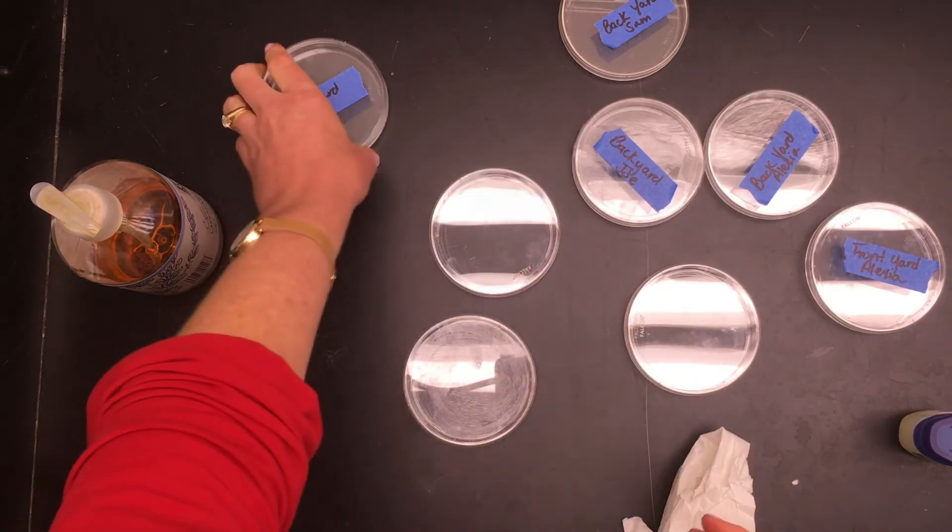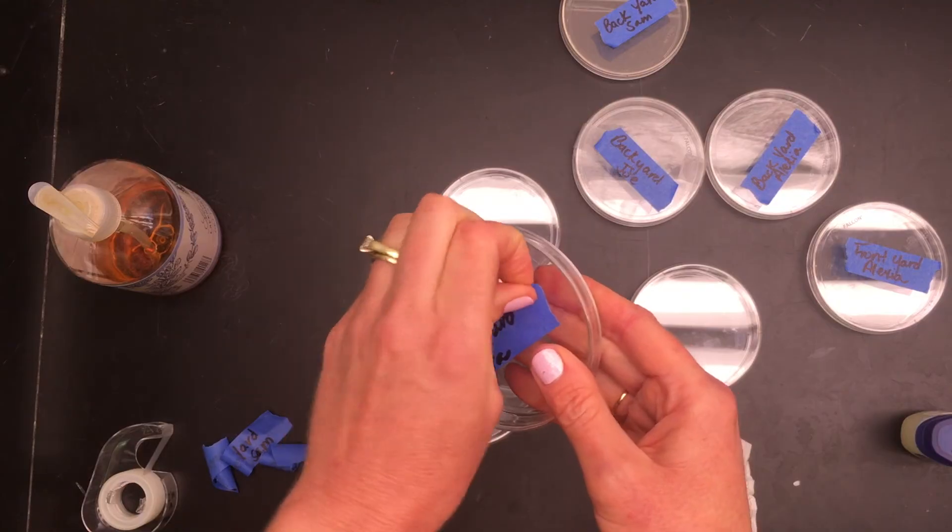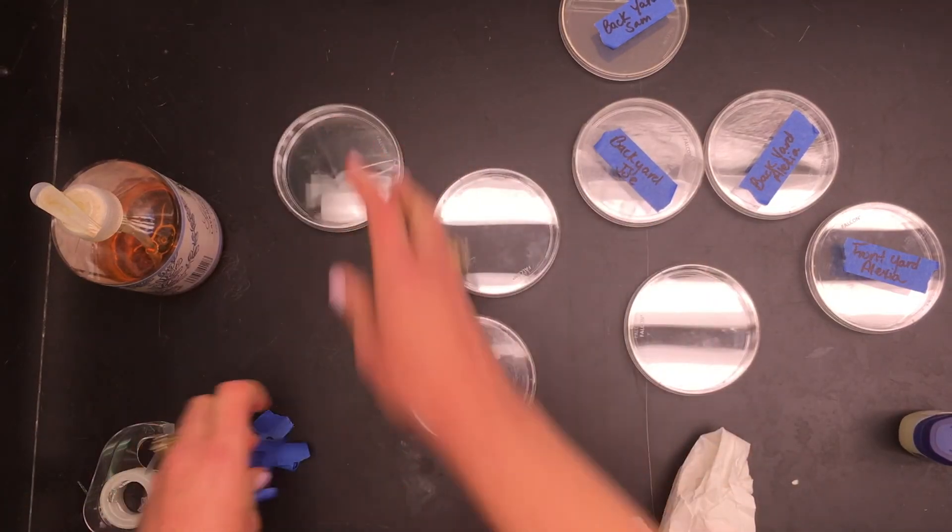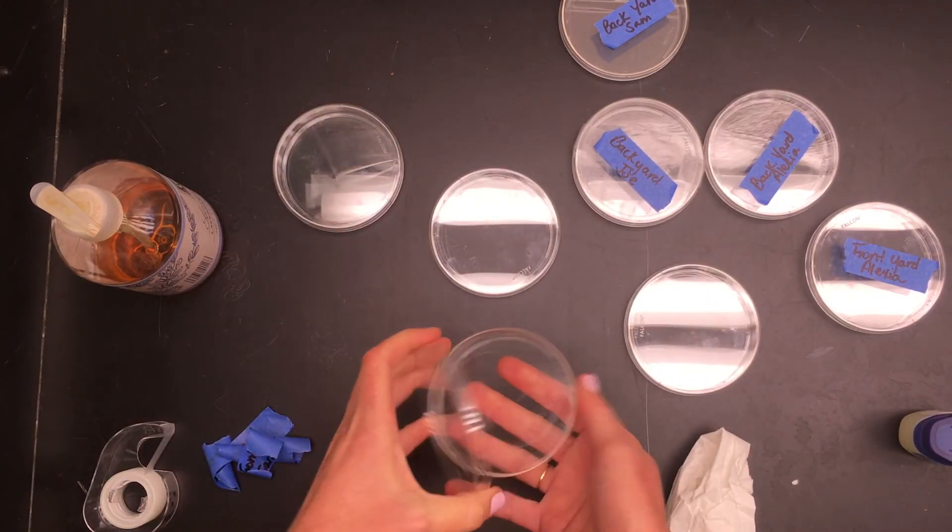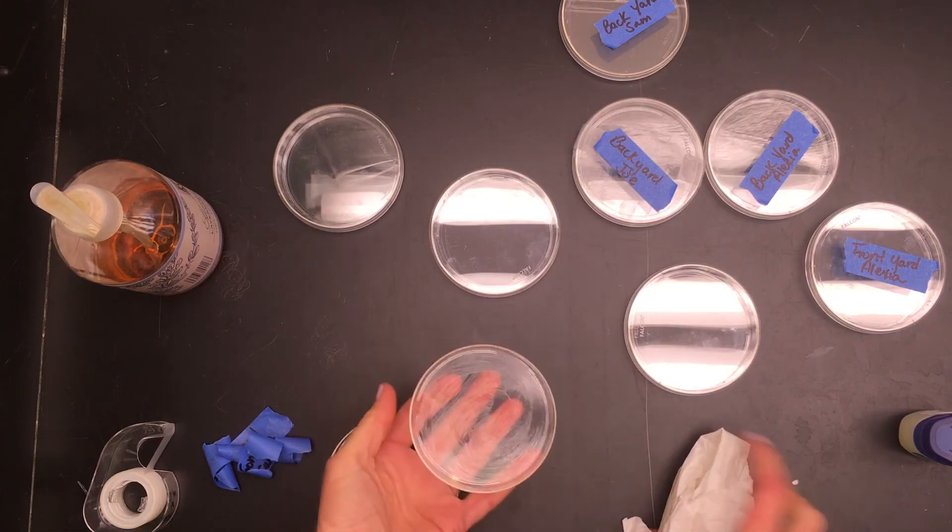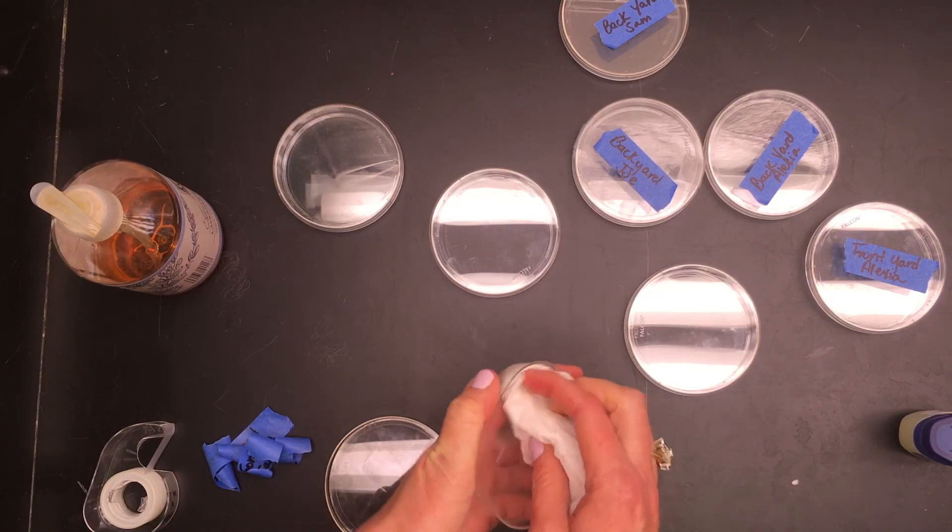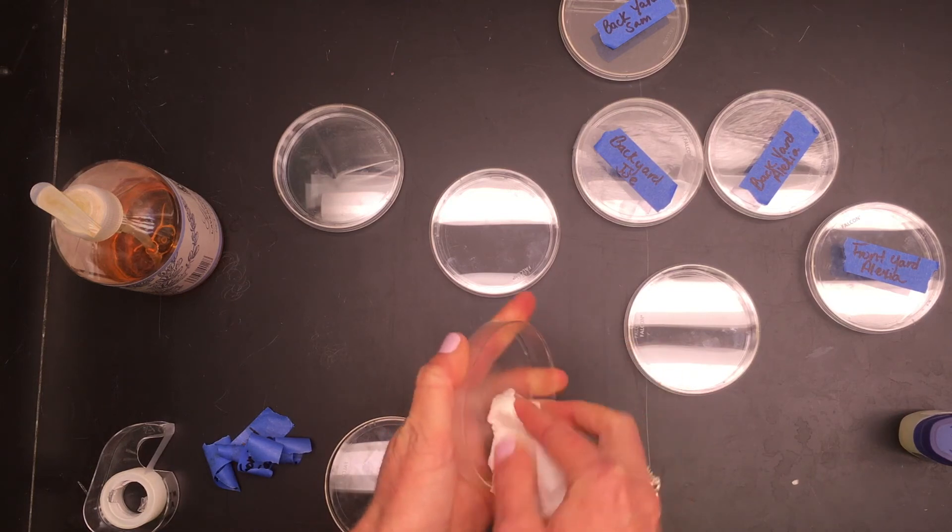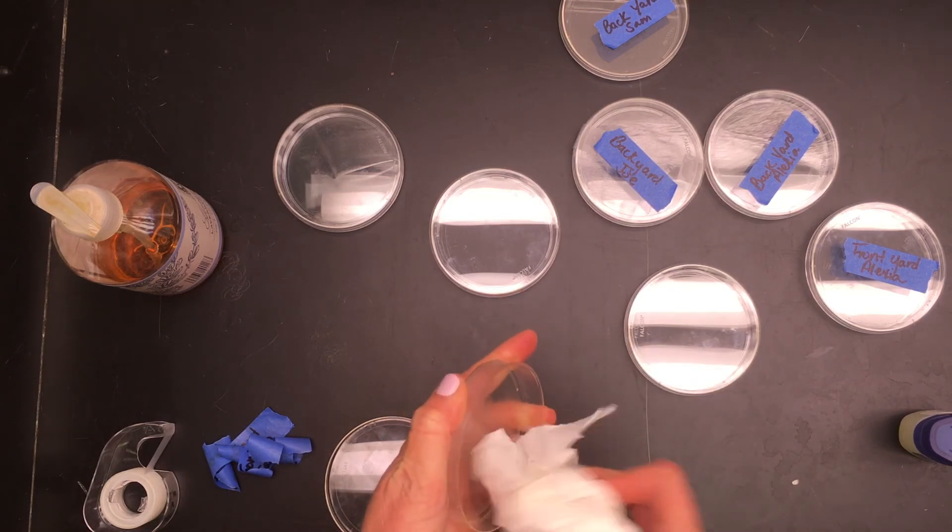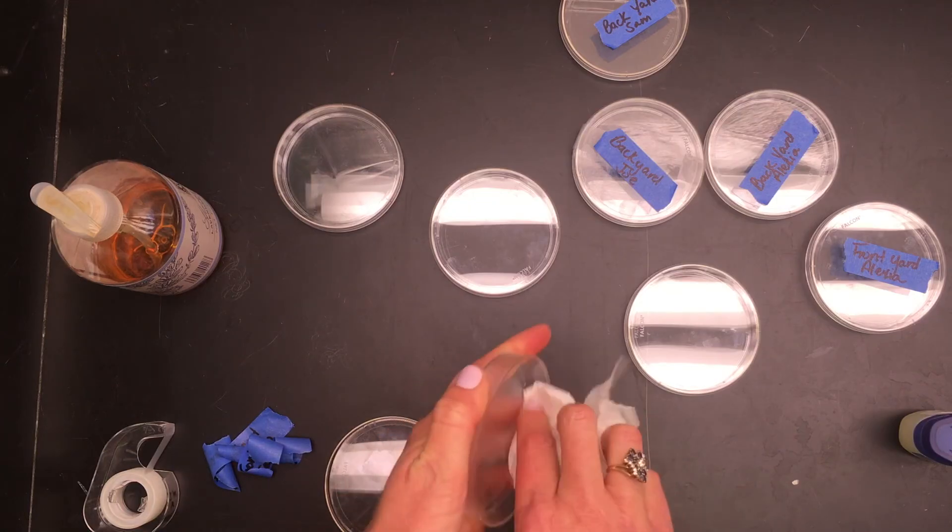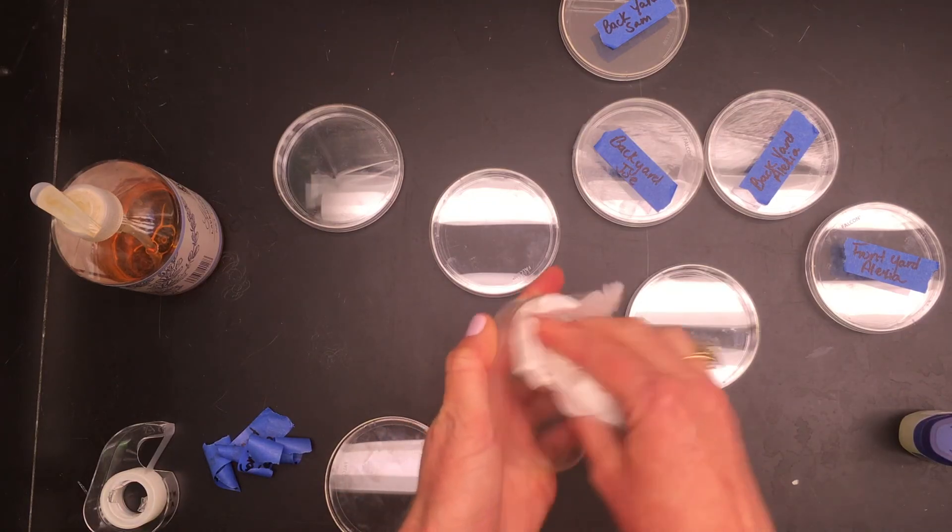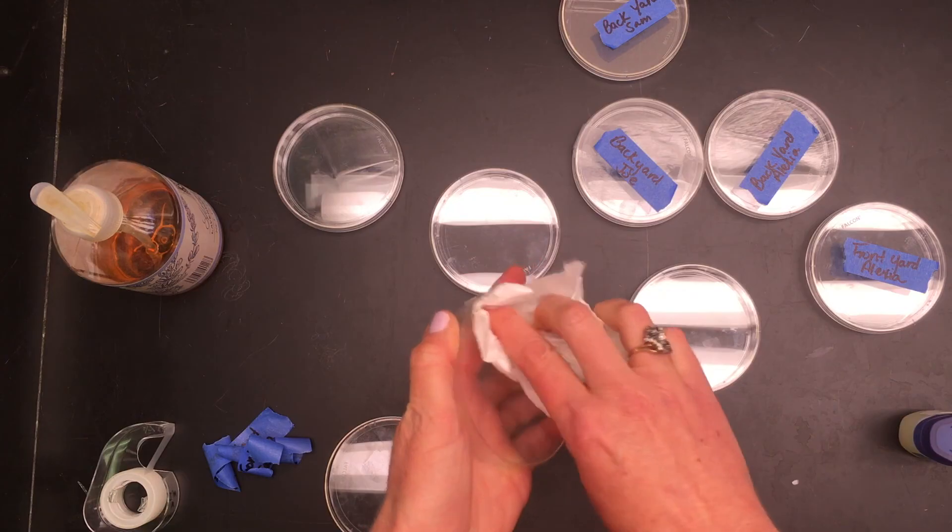Petri dishes are plastic, so we want to keep them out of the landfill. They can be reused again and save some money on petri dishes for the following year. So you're gonna have petroleum jelly in the bottom of your dish. First thing you do is just take a paper towel and wipe most of it out.